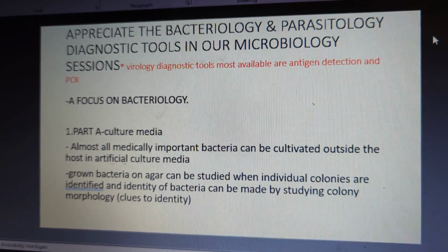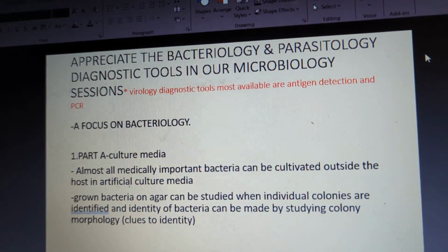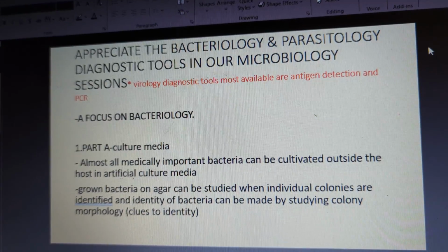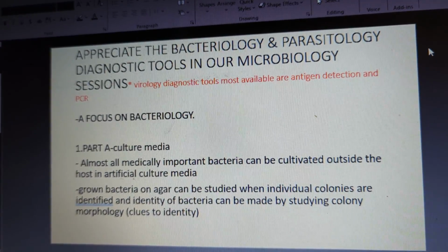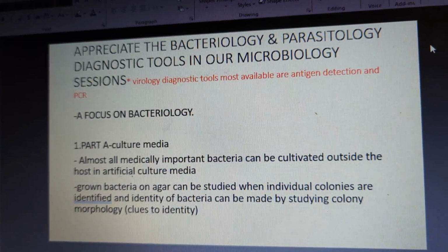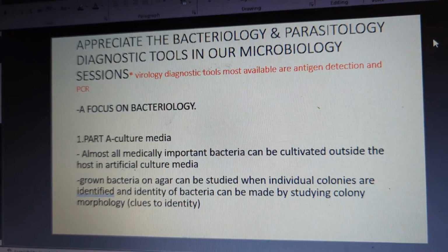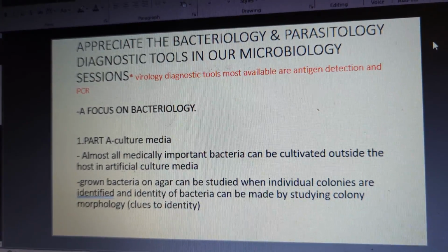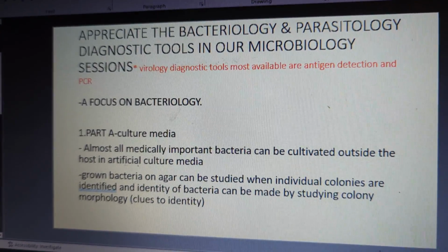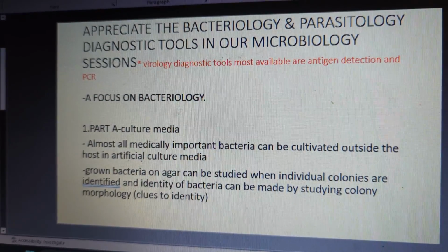So our particular focus in the microbiology sessions we will have is under bacteriology and parasitology, but you can appreciate that small note there that virology diagnostic tools most available are the antigen detection and PCR. So this session is focused on bacteriology.